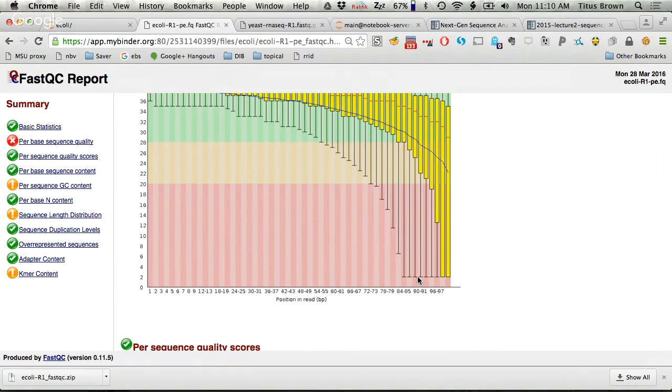Quality drop off, you know, the last 10 bases. Right. So the question is, can we just look at this chart and go, you know what, I really don't like the look of the last bits? And so this comes back to a little bit of the discussion that we had at the beginning before you came in, which is that these Q scores are statistical, right? So even at a Q of 20, only 1 out of 100 of these bases are actually wrong. So if you're going to throw away data where that on average is 99% correct, that's actually throwing away a lot of data.